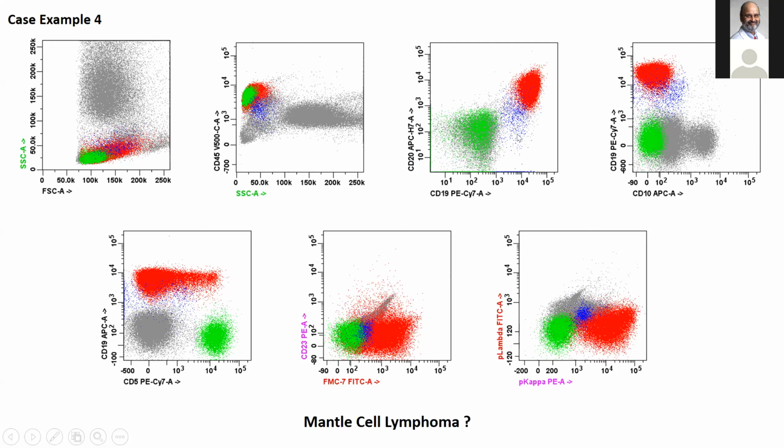Now, I want to point this out to you guys because I didn't do this purposely, but it's a nice representation of this. You can look at flow cytometry data using either a logarithmic scale or a bi-exponential scale. When we were doing 4-color flow cytometry, we always looked at a logarithmic scale. Now that we're on the 10-color machines, we're typically looking at bi-exponential scales.